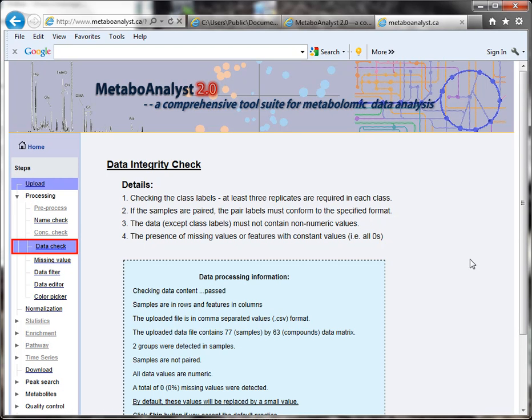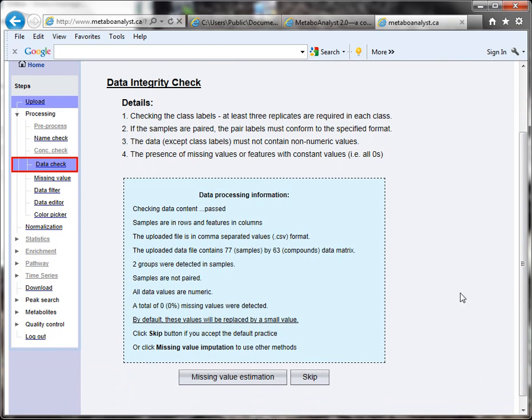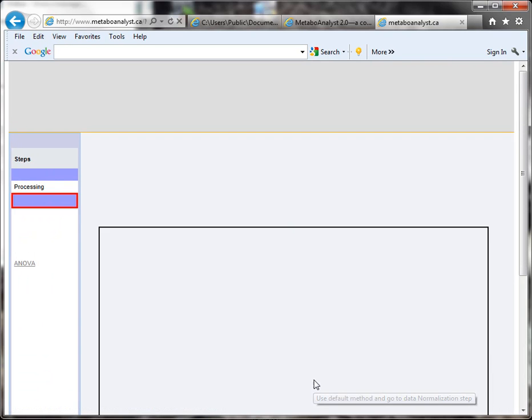Very quickly we get a page where we can check the data integrity. For this quick tip, I'm going to skip this step.